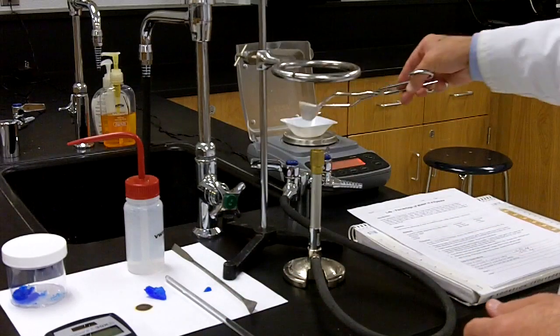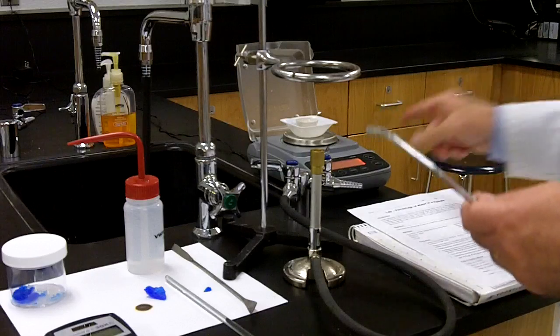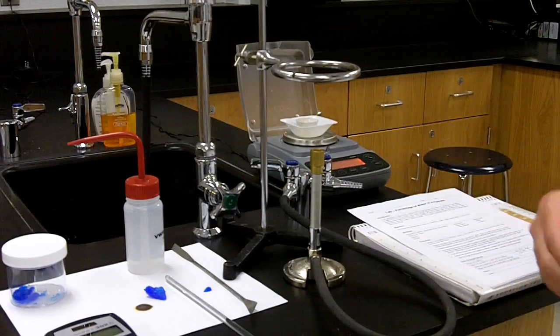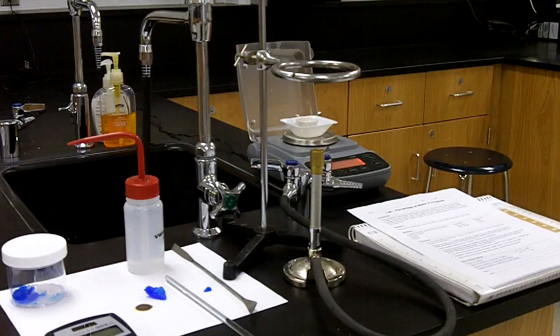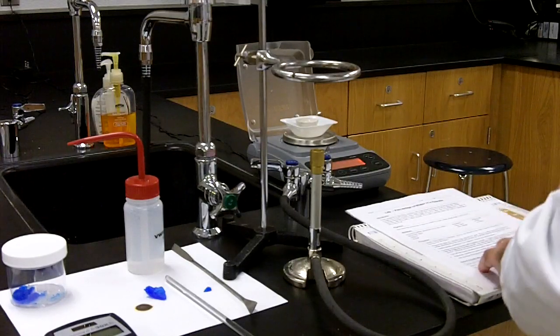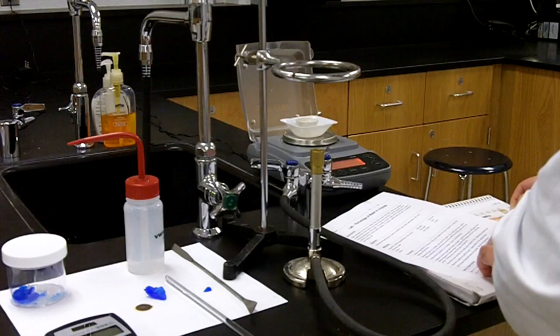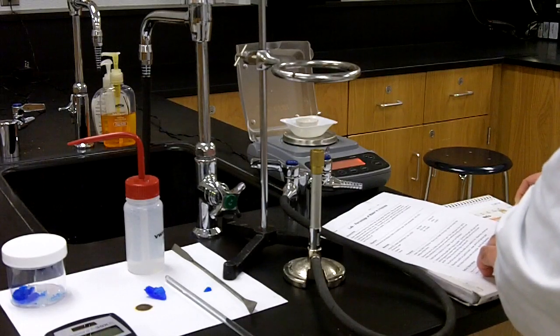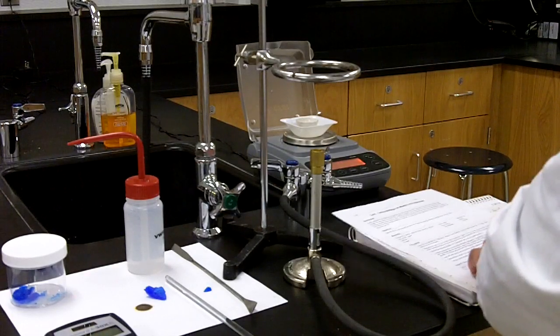Now I'm just going to place it onto the scale. I previously balanced the scale, and the scale, by the way, should be measured up to a one hundredth of a gram. In this case, I get 12.51 grams. So I'll record that 12.51 grams as the mass of my crucible.